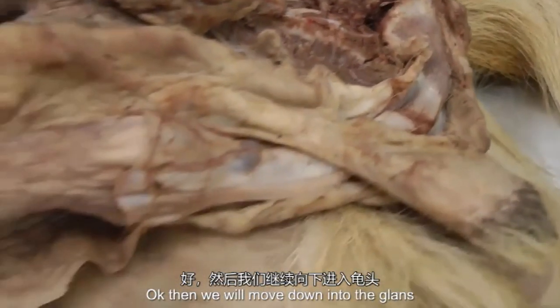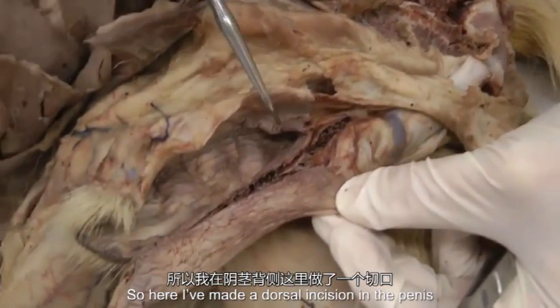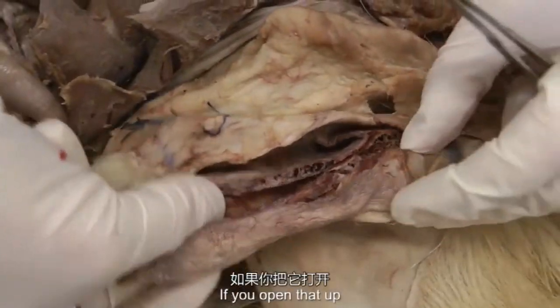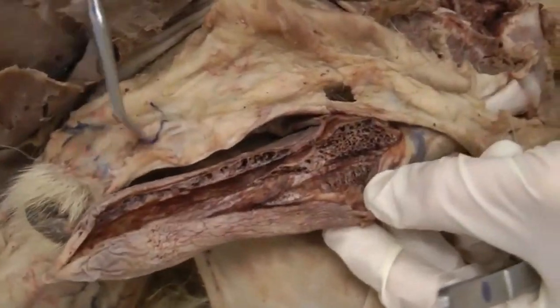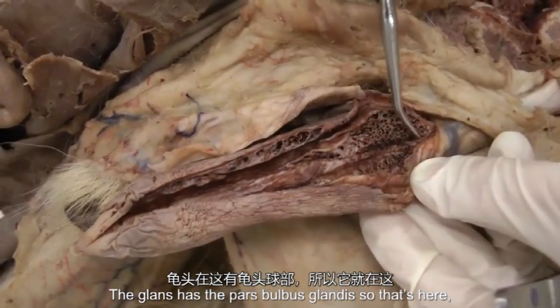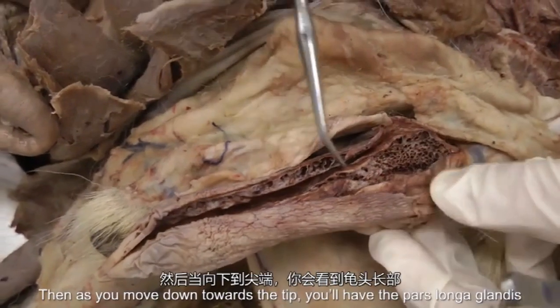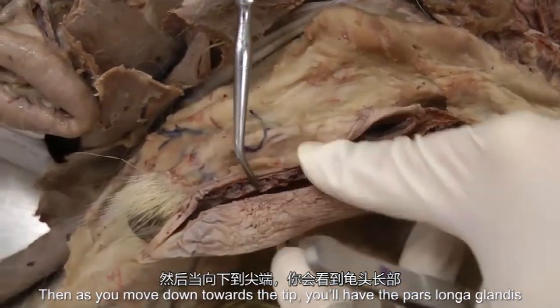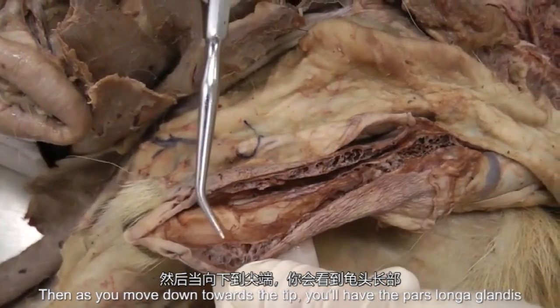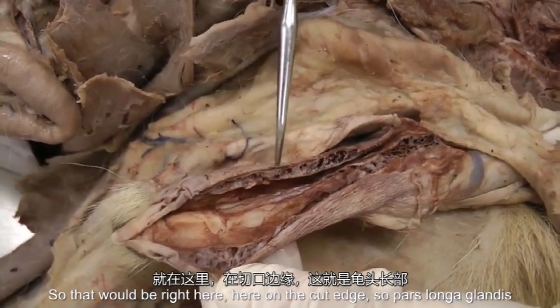Okay, then we'll move down into the glans. So here I've made a dorsal incision in the penis. And if you open that up, the glans has the pars bulbus glandis, so that's here, pars bulbus glandis, there. And then as you move down towards the tip, you'll have the pars longa glandis. So that will be right here, here on the cut edge.